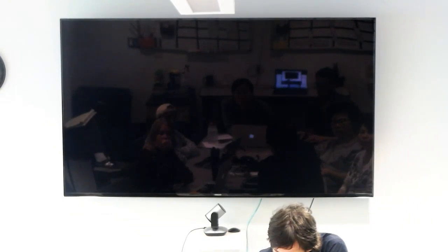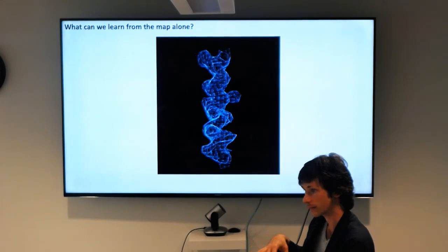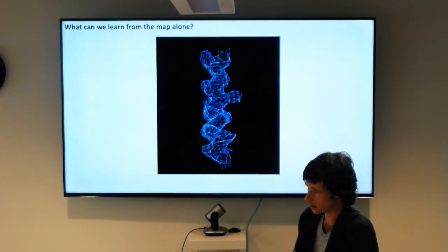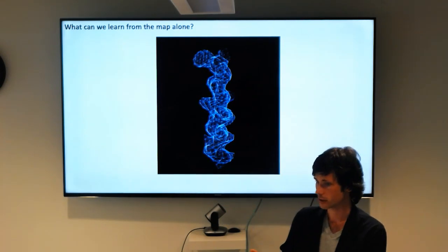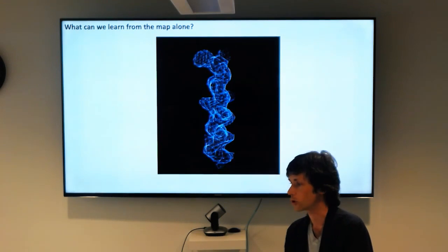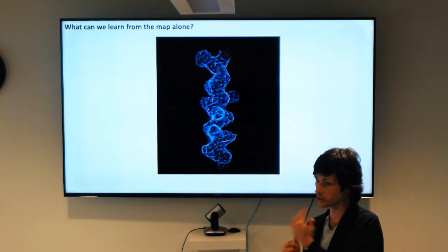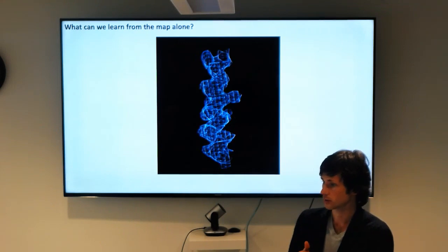And that's really obvious in this case because we're at relatively high resolution. But if you're at 4.5 angstroms, that can be tricky. The reason this is even a consideration is because in Cryo-EM, if you're solving a structure ab initio, you can converge on the right-handed or the left-handed, the correct or the inverted model, with equal probability. So if you're working particularly in the lower resolution range, like the 4.5, 5 angstrom range, you want to be paying attention to that.